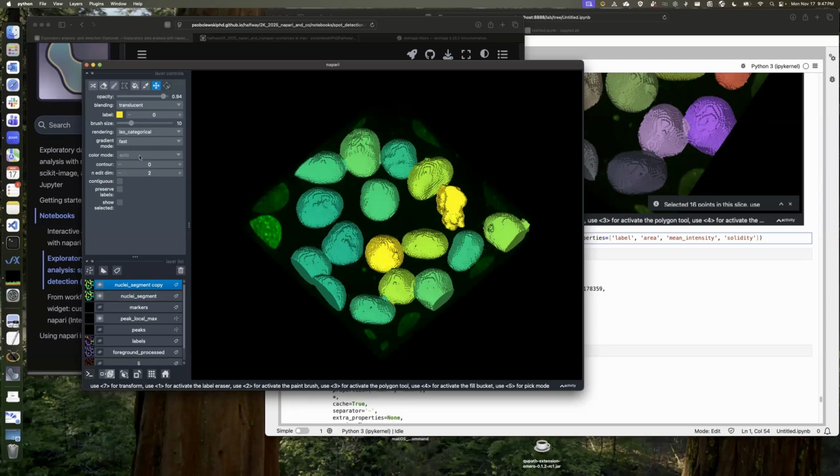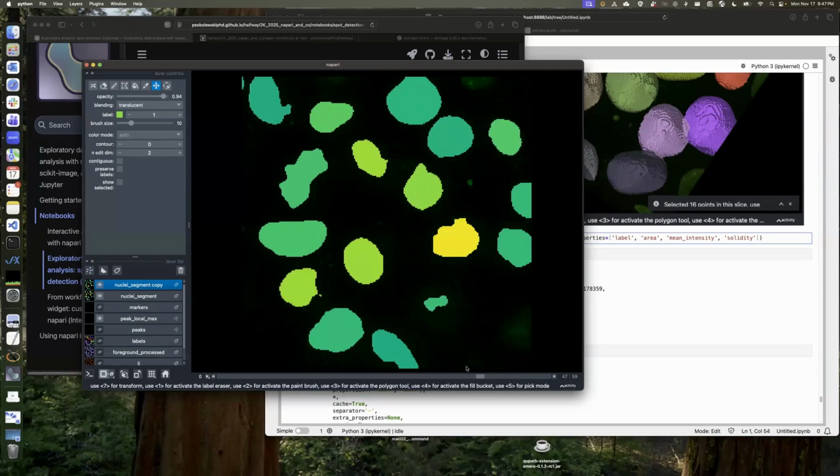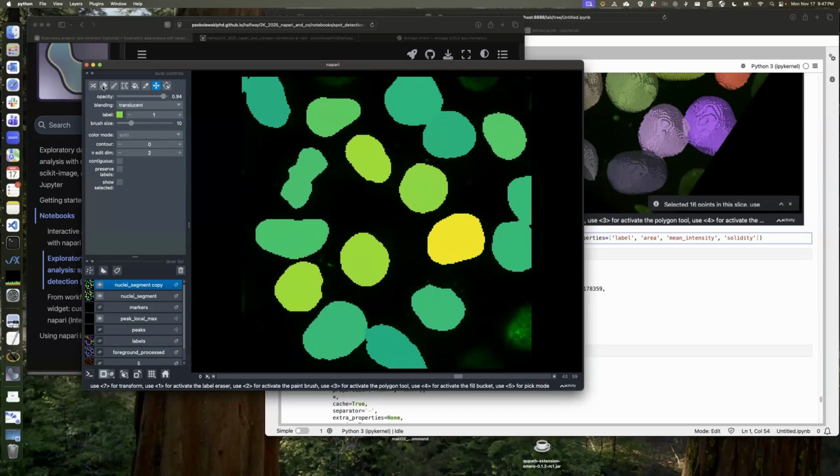And then I'm going to just turn this back. Oh, I just messed that up. Okay, I wanted the eraser tool. So basically, you have two options. Let's say we want to separate these two, right? So option one would be to use the eraser, boom, and then just change the brush size, right? And then you could just erase between the two. Oh, that didn't really work, did it?